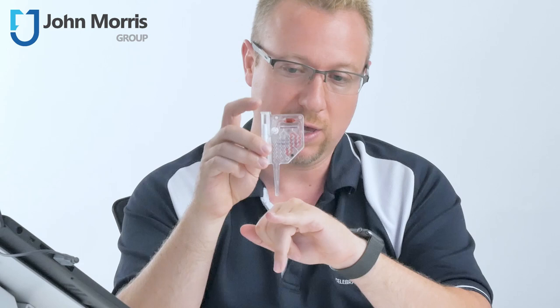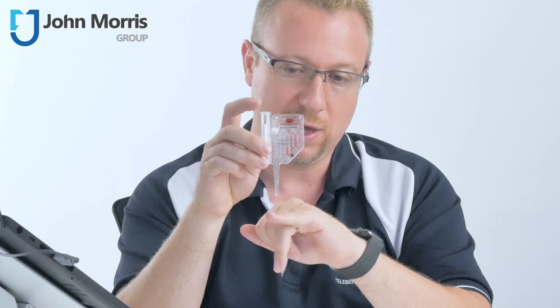And it's really easy to do. Once we've taken a sample, we simply slot it into the machine and we push run. Let's give it a go.